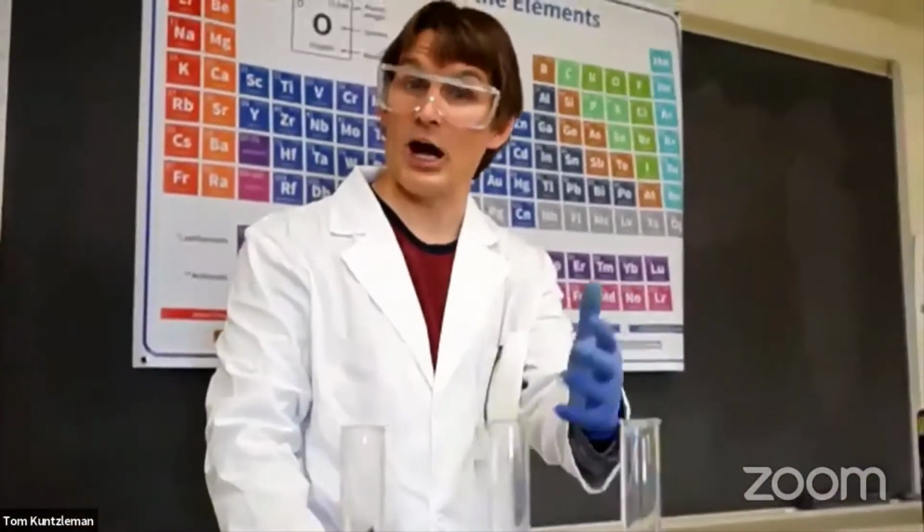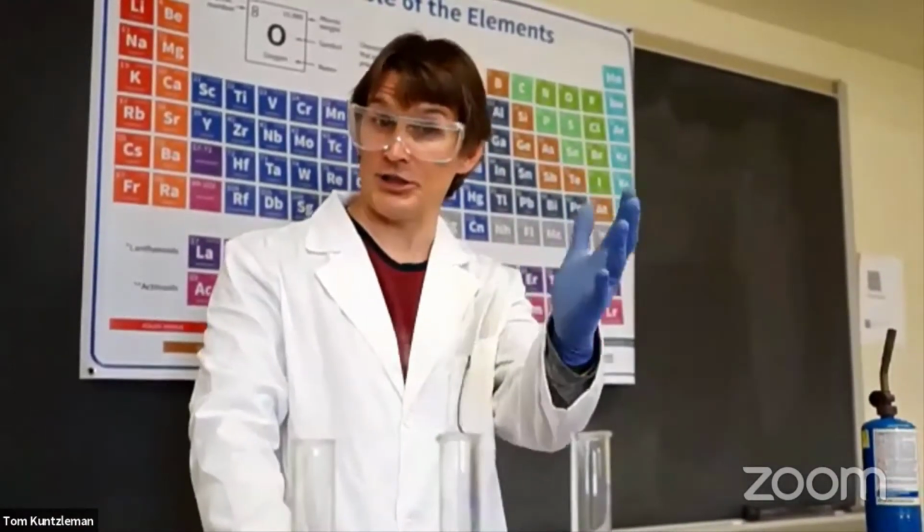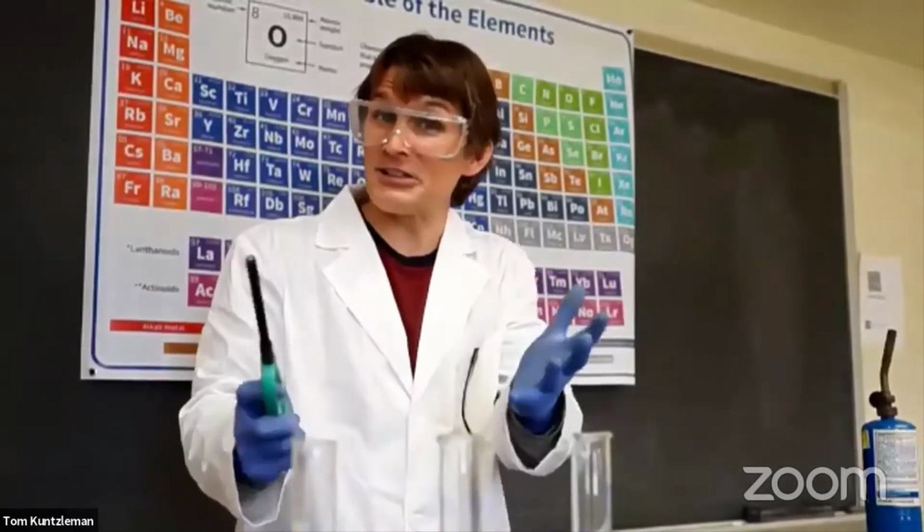Now the bubbles that you see, there's another reaction that happens to go on with this. It's the formation of hydrogen gas, and hydrogen gas reacts with oxygen in the atmosphere to form water, and it releases a lot of energy.